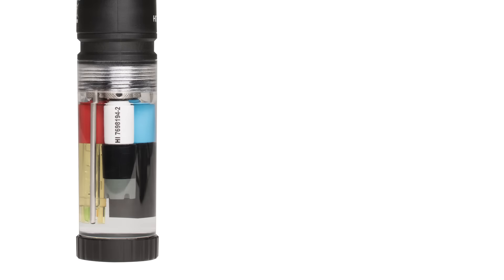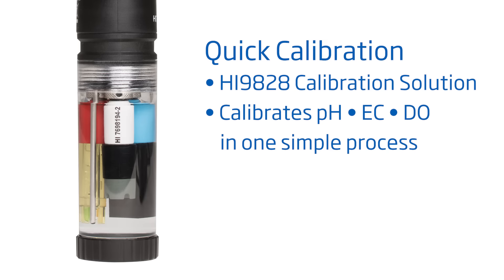Calibration is an important step to ensure the most accurate measurements. We recommend calibrating for each use. Although you can calibrate each sensor individually, in this video we'll do a quick calibration. Quick calibration is a great way to calibrate for pH, EC, and DO, all with one process.